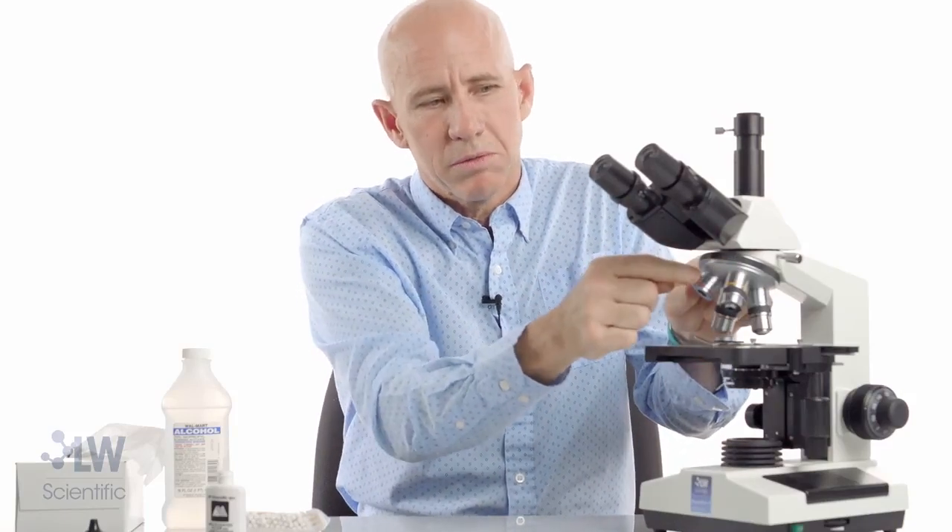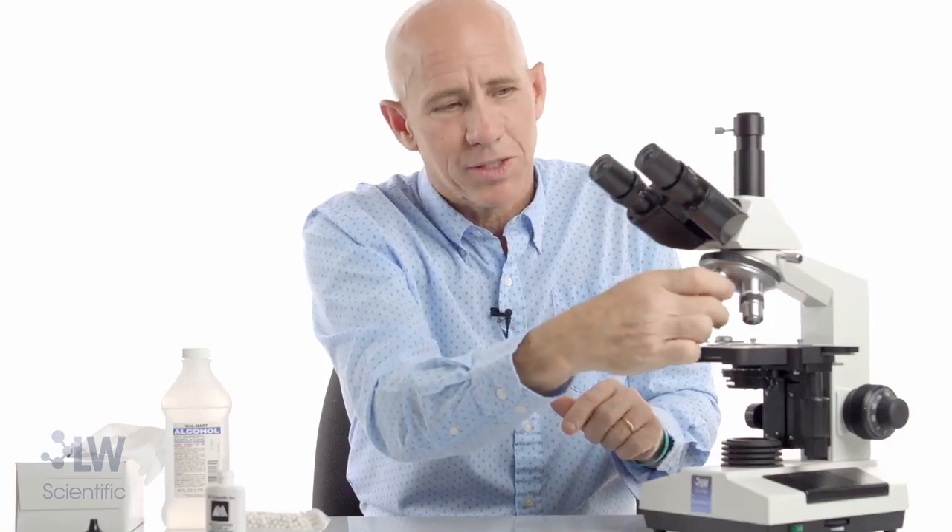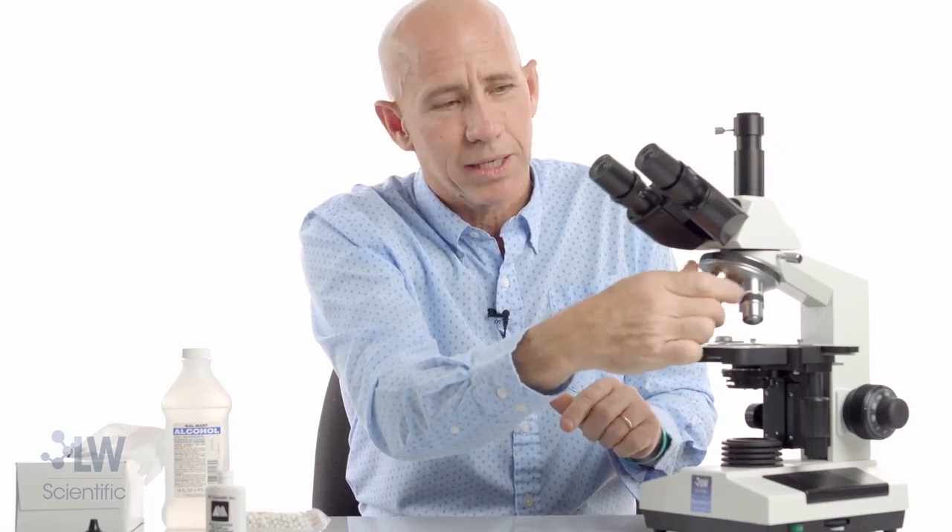I don't need to clean my 4x. I don't need to clean this 10x. I will clean this 40x. And this is kind of the best thing you're going to see on this video — how to clean a 40x objective.